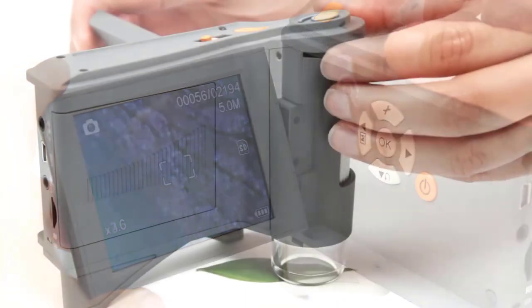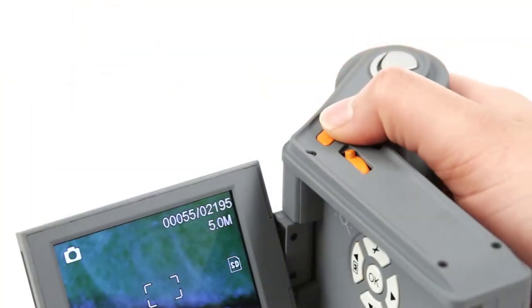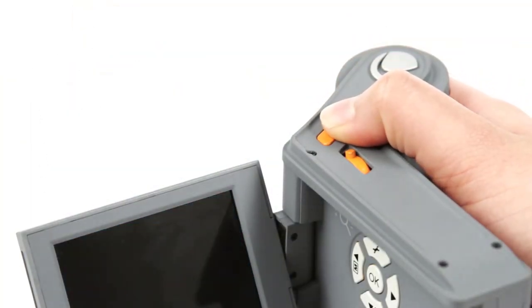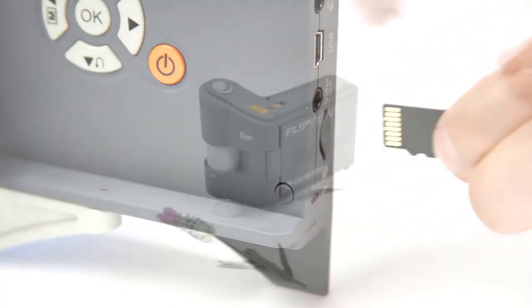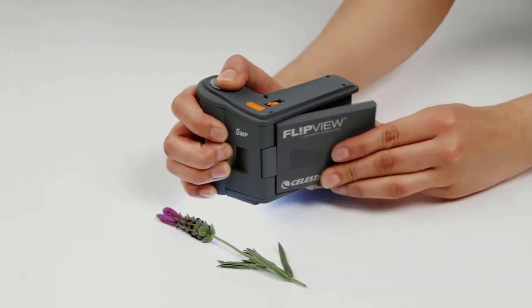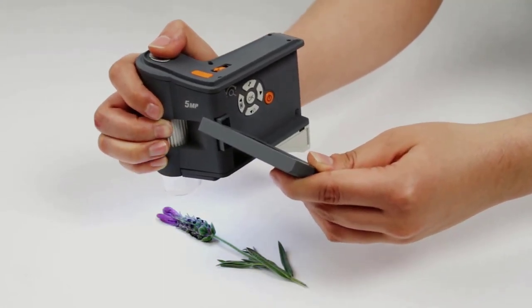The maximum magnification is 120x, but there is the option to link the device to a PC to get a higher 300x view and the benefits of a larger screen. The battery is rechargeable, and there is a built-in light. You can use the flip view handheld, or resting flat on the subject, but a stand is also provided for lab-like observations.